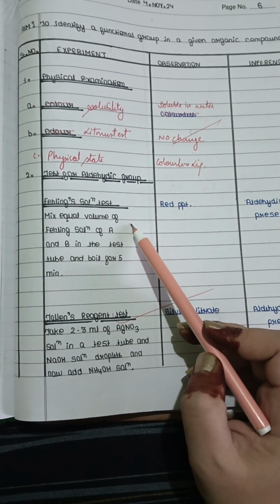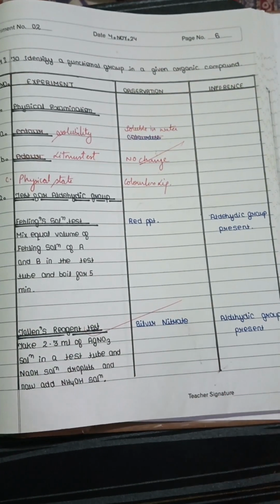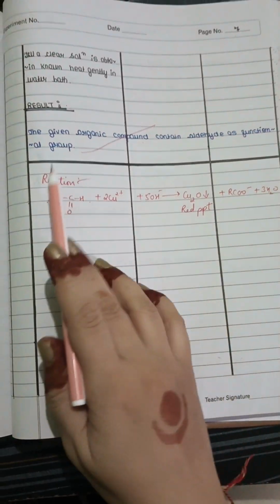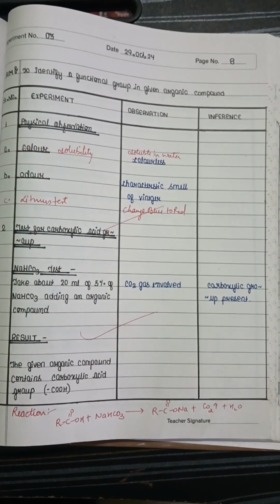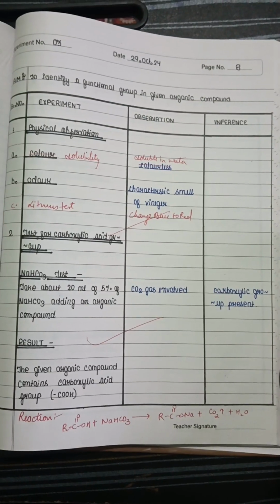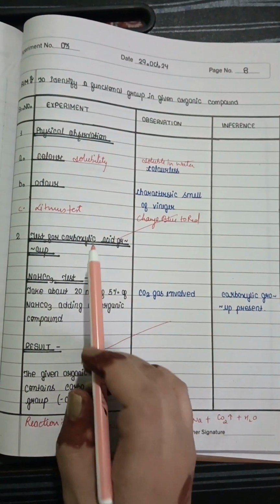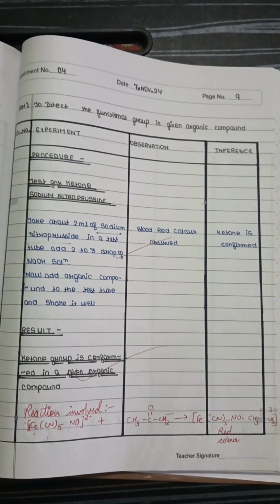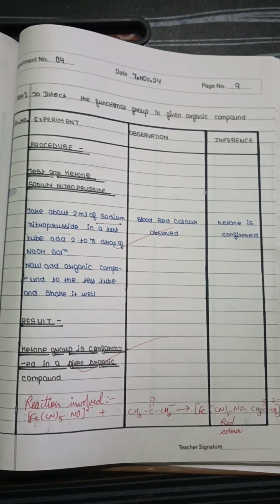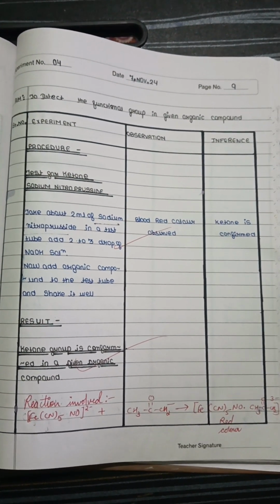Either you go for Fehling or Tollens. This is the reaction involved. Next is to identify the organic compound, and this is carboxylic acid. This is your carboxylic acid. And finally comes your ketone, which is sodium nitroprusside testing.